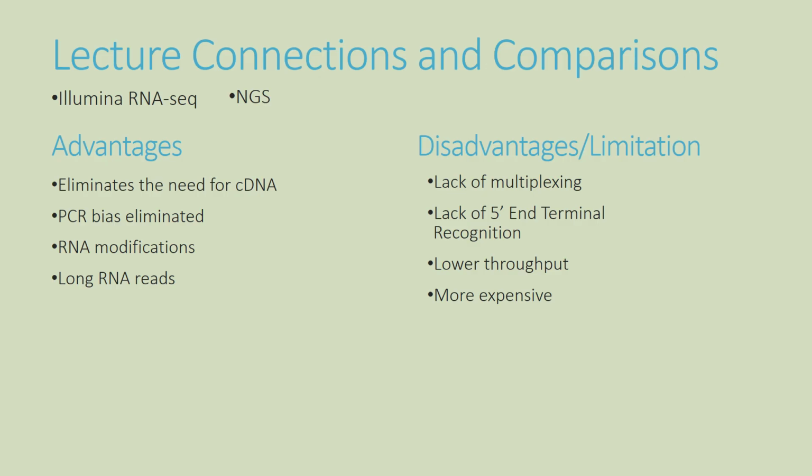This technique ties into our next generation sequencing module, and this can be directly compared to the Oxford Nanopore sequencing using DNA or cDNA that we discussed in class, and also the Illumina RNA-seq that we discussed in class.